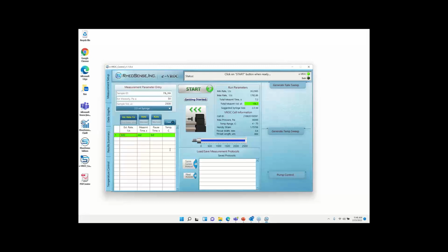It's a little tricky, let's say you have the steady shear data and you need to try to convert to what you would think the extensional viscosity would be. That can be challenging, particularly with non-Newtonian fluids where we know the Trouton ratio could be quite high. So the reality of it is you're going to scope things out.